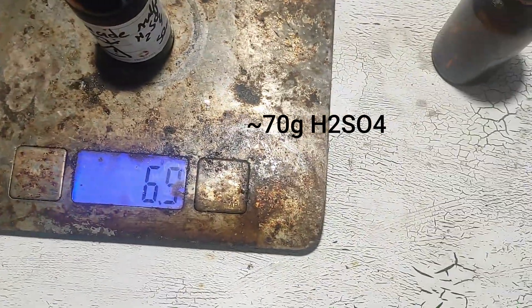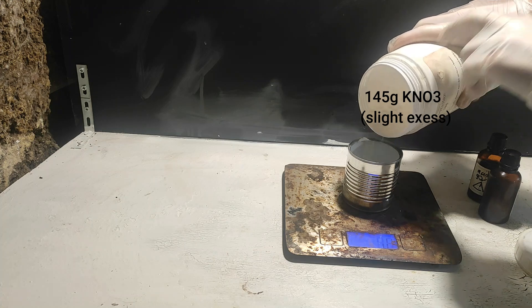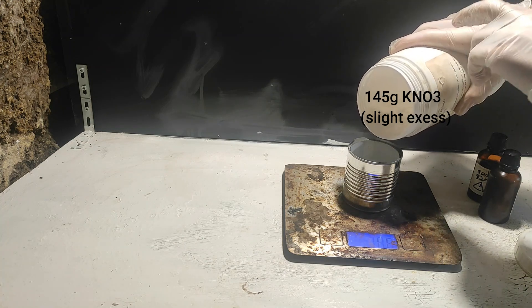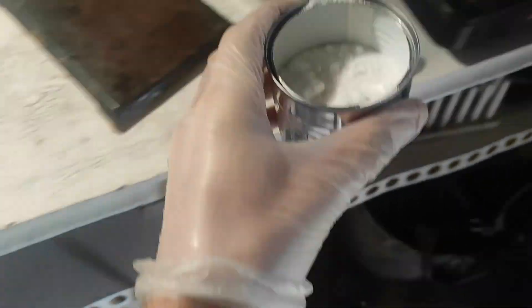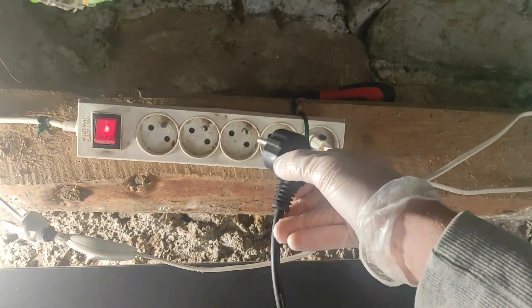We start by measuring around 70 grams of concentrated sulfuric acid that I made in a previous video. Then we weigh 145 grams of potassium nitrate. See those big chunks? It means it's not dry and we need dry chemicals. So I decided to heat it on a hot plate to drive off most of the water.